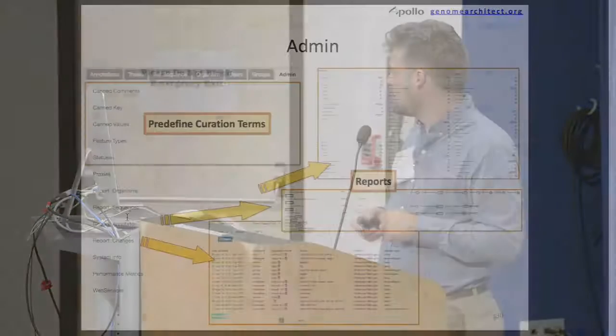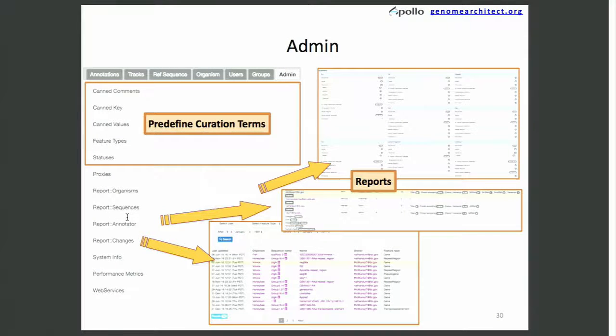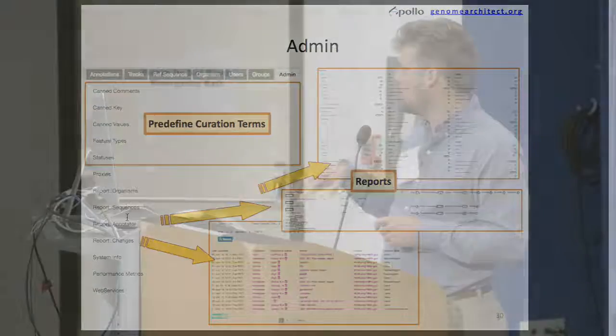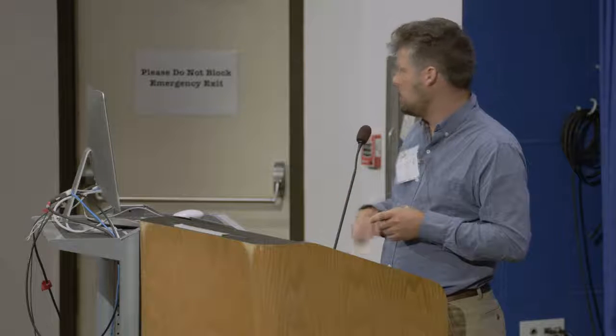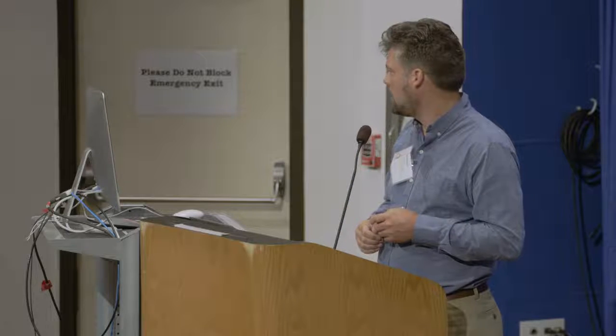We have an administration screen as well, which allows reports — the types of reports you would think — as well as this predefined curation term section. This is important because if you have lots of curators curating lots of things, they'll come up with different ways of saying the same things. Having this set of predefined canned comments or keys is important just to standardize how researchers are describing these annotations.